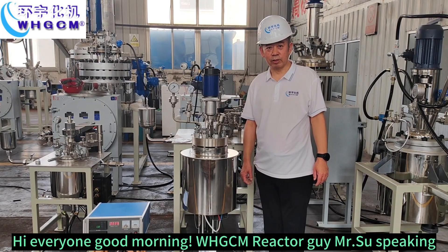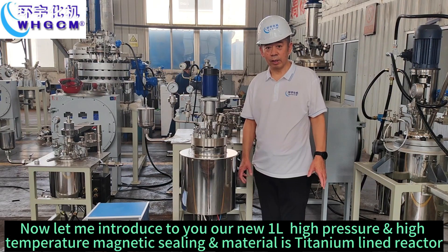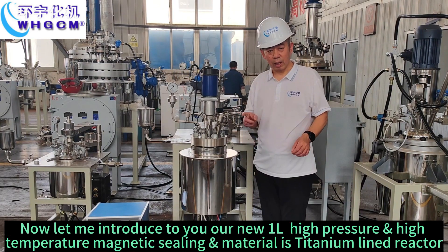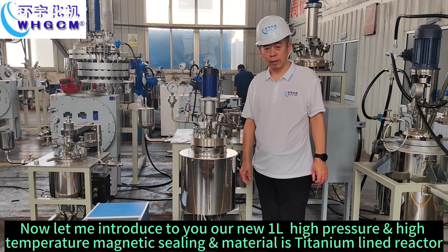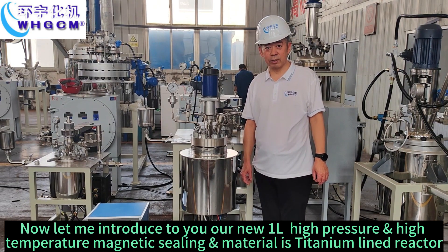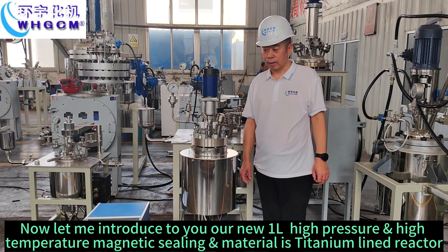Hi everyone, good morning. WHGCM Reactor Guy, Mr. Su speaking. Let me introduce to you our new 1L high pressure and high temperature, magnetic sealing, and the material is Titanium lined reactor.